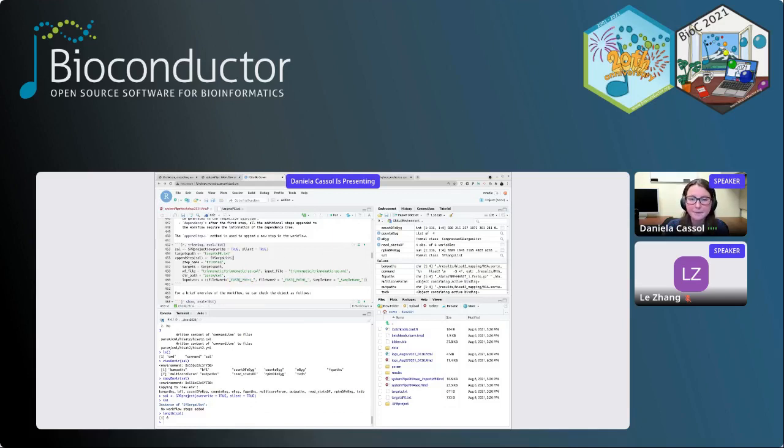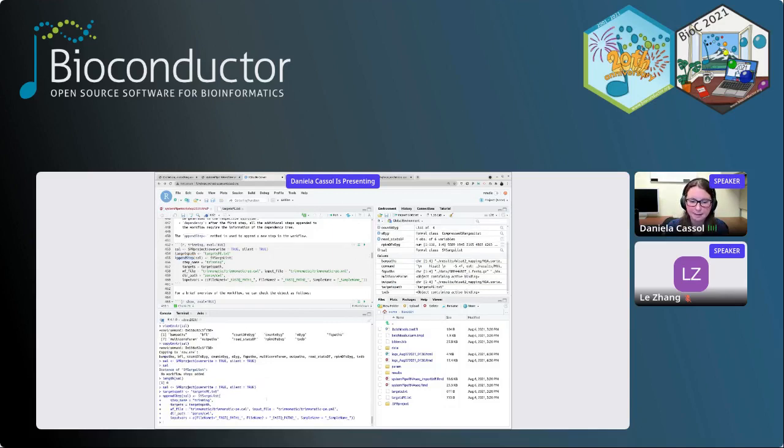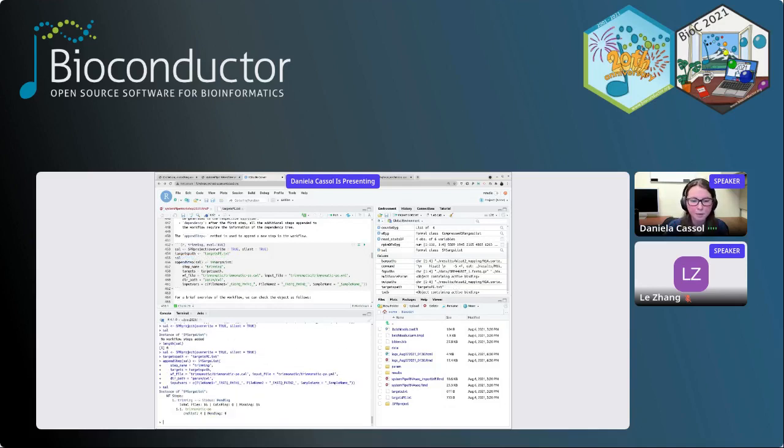Before I run this, the other thing I would like to mention is the appendStep method. That is taking this object, the sal, the empty container, and appending the step we are creating. So let's run that, and now we can see, down here, we have the instance of SYSargsList with one step. It's Trimmomatic. The status is pending because I refreshed everything. And then we have our first step from the command line.